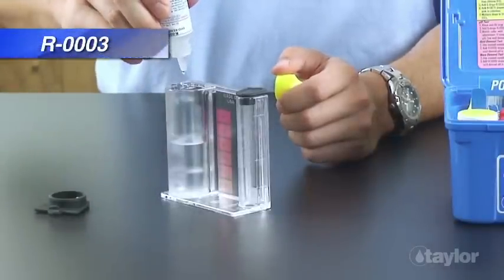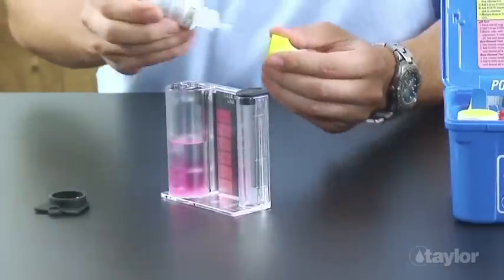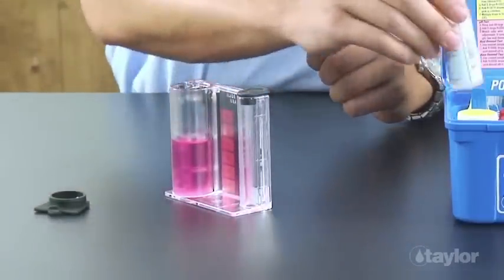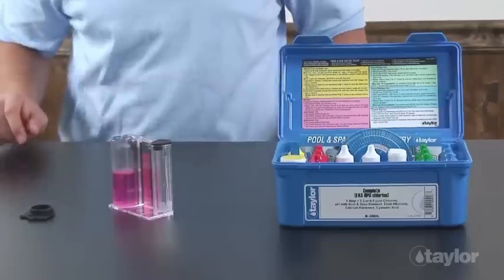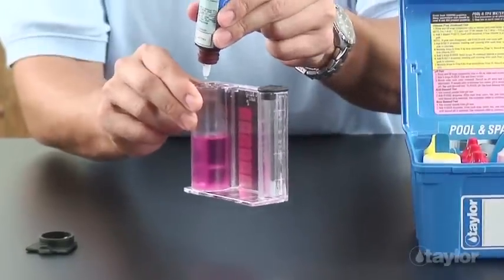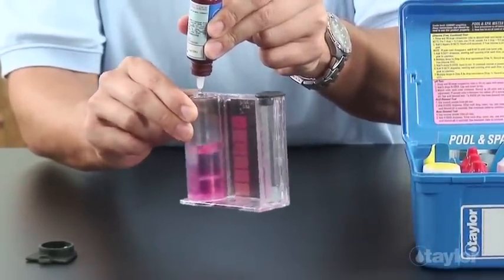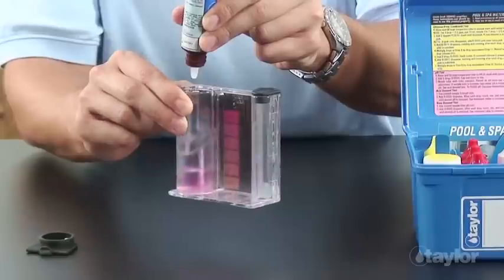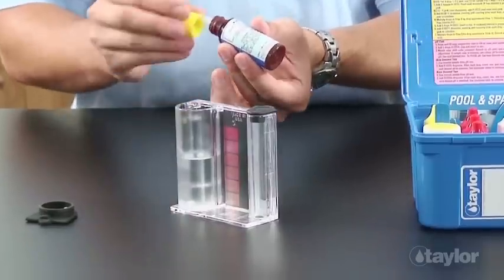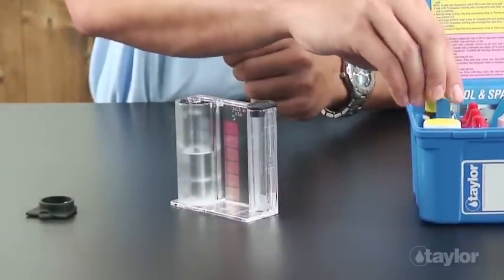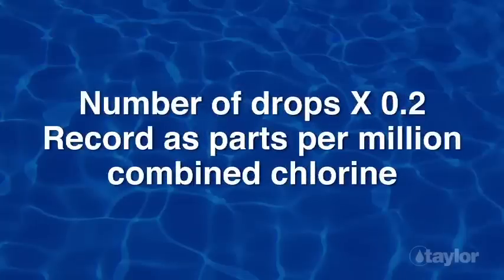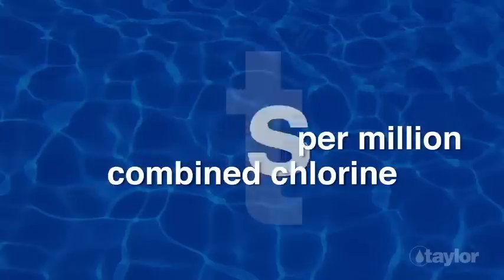Add five drops of reagent 3 and swirl to mix. If combined chlorine is present, the sample will turn pink. Add FAS-DPD titrating reagent for chlorine drop-wise, swirling and counting after each drop until the sample goes from pink to colorless. Add one more drop of titrant after the endpoint to be certain the color change is permanent. If the color remains unchanged, do not count this drop. Multiply the drops expended by 0.2 and record as parts per million combined chlorine.